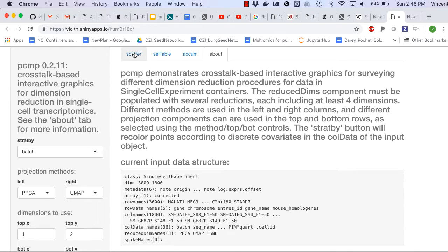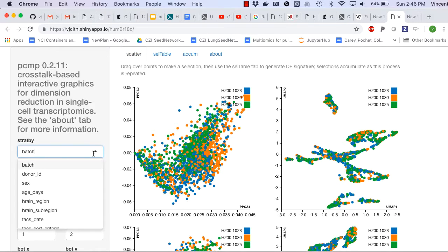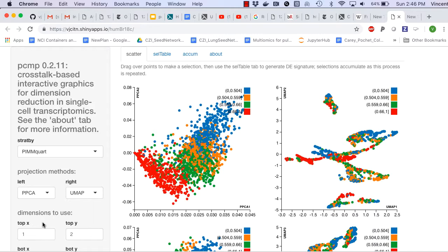The quartiles of this measure, which we can find as the last variable here, pim-cort for percentage of immature transcripts, we've taken the quartiles of the distribution of that. They show a remarkable gradient in the PC1 versus PC2 projection.